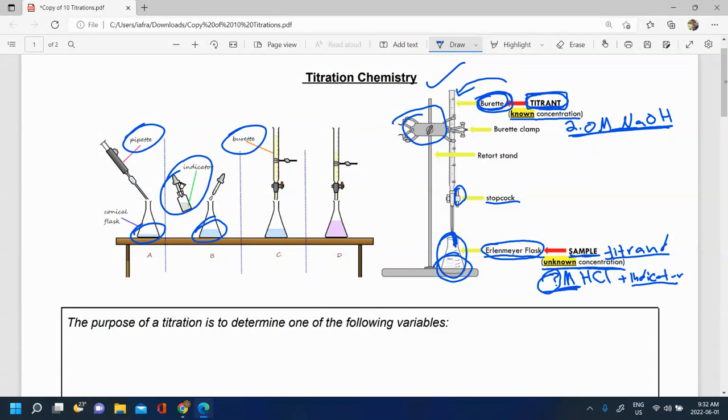Then you fill up your burette with some of the titrant, the stuff of known concentration, and you start adding your drops of the titrant. And then when you get your color change, that's when you know to stop the titration and that all of your substances reacted.